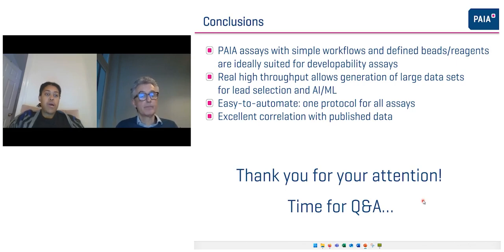And is it possible to multiplex? That's also a pretty common question. Unfortunately, no. So we're running all the assays with the same wavelength, it's only one wavelength that we're using, and that's in the red region. So excitation is 630, 670 emission, to give you an idea.